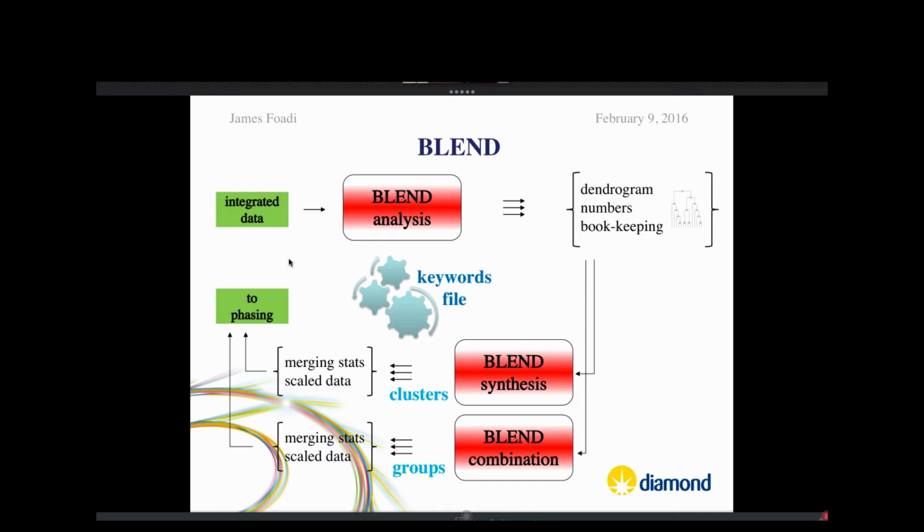A new mode has been recently introduced in the program with the aim of guiding the selection and filtering of datasets in combination mode. This is the graphics mode, and at the moment it includes procedures to produce dendrograms with specific annotated values around each cluster node. In future, it will include procedures for the production of additional graphics, like, for instance, the reciprocal space completeness diagrams.